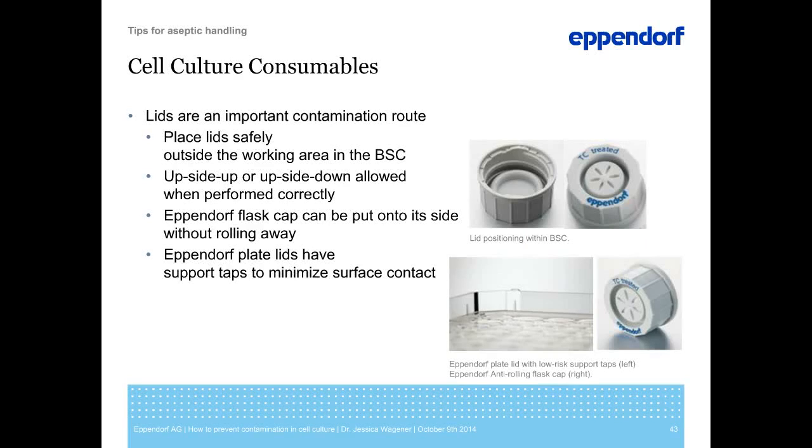In the last 3 slides of my presentation, I want to talk to you about the vessels that are in constant and direct contact with your cells, the cell culture consumables. When you open a plate, dish, or flask, the lid should be placed outside the working space, but inside the BSC, of course. Some people hold the lids in hand while pipetting, but this requires practice and routine because you have to avoid touching the inside of the lid while holding it. When you are placing the lid aside, you can position it inside up or inside down. Both ways are okay when performed correctly.